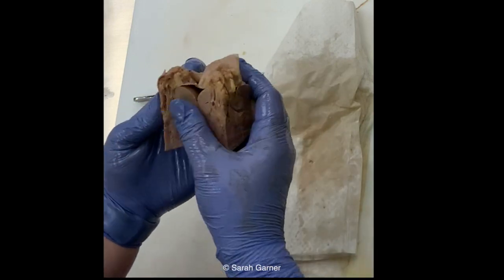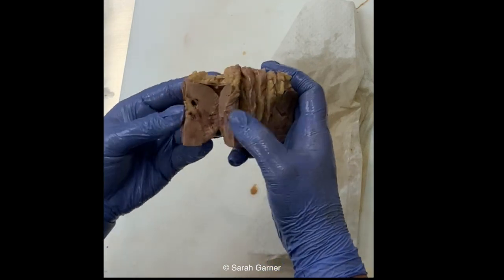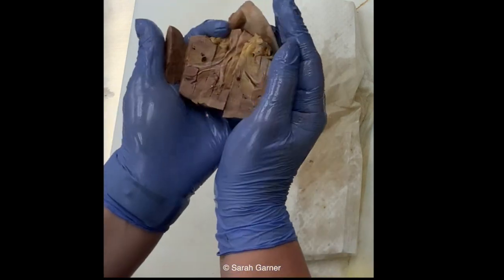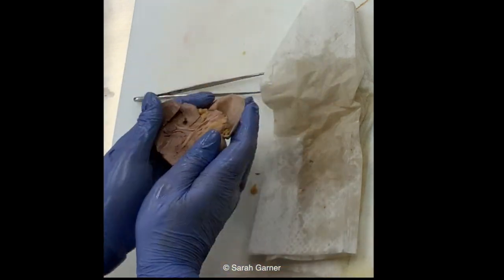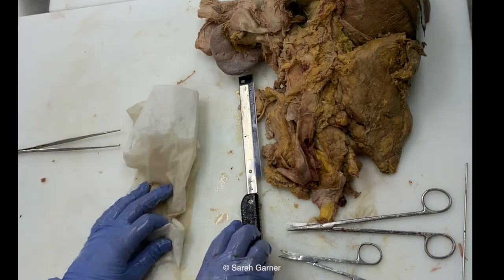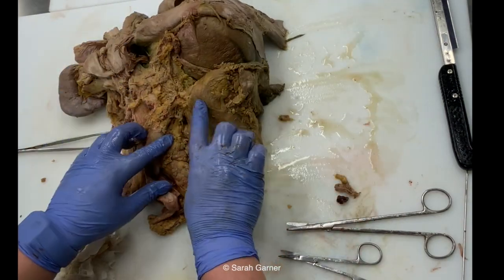So same thing here. You're just going to kind of flip through it, note anything abnormal. If you find anything abnormal, take a section, take a photo, take measurements if you need it, take everything that you need, and then piece it back together as best you can, sit it to the side for review later. So then you're gonna do the exact same thing with the opposite kidney. So we just did our left, so now we're gonna do the same thing with our right.